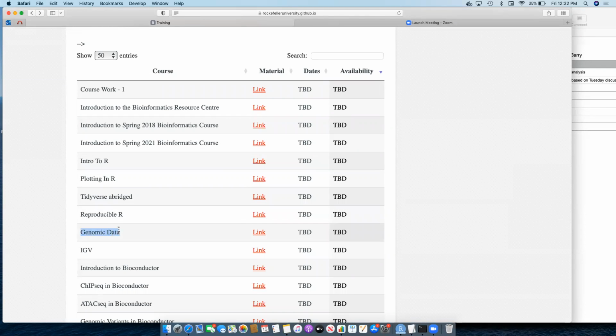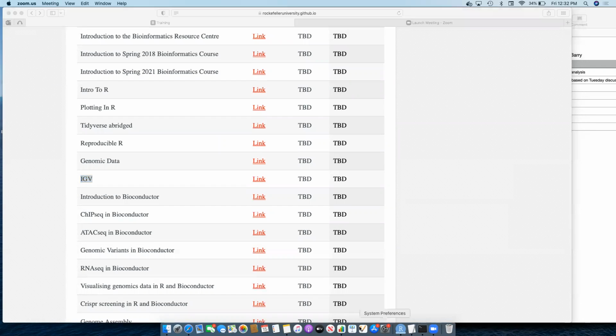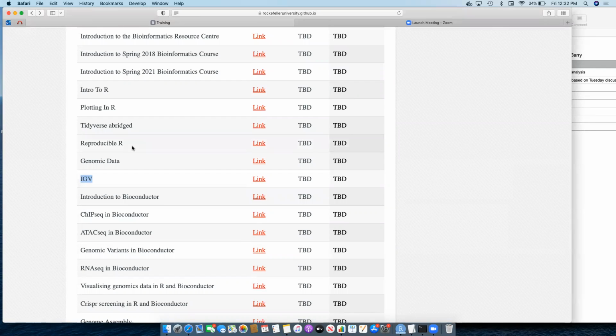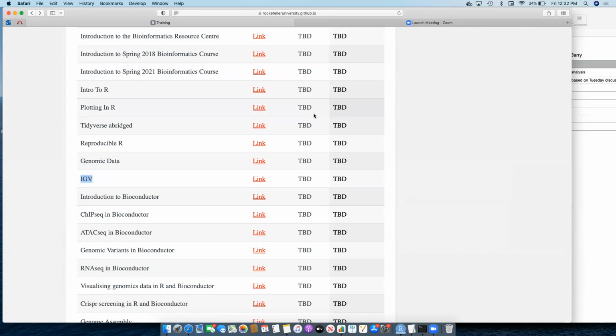And then in our last sessions, we covered genomics data, the type of data we will see during our high throughput sequencing analysis. And hopefully we saw a little bit how, once we have processed data with genomic coordinates, we can start to visualize this in a nice linear genome browser. And that's actually really useful. Whatever data you get, do try and visualize it in IGV. You'll see artifacts, you'll see features you won't discover programmatically.